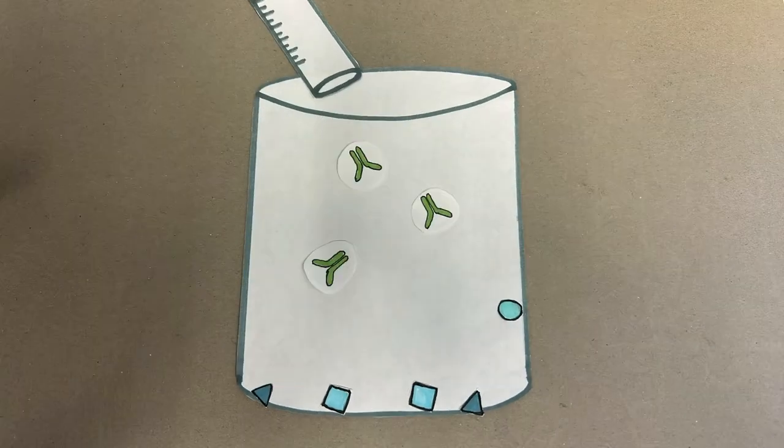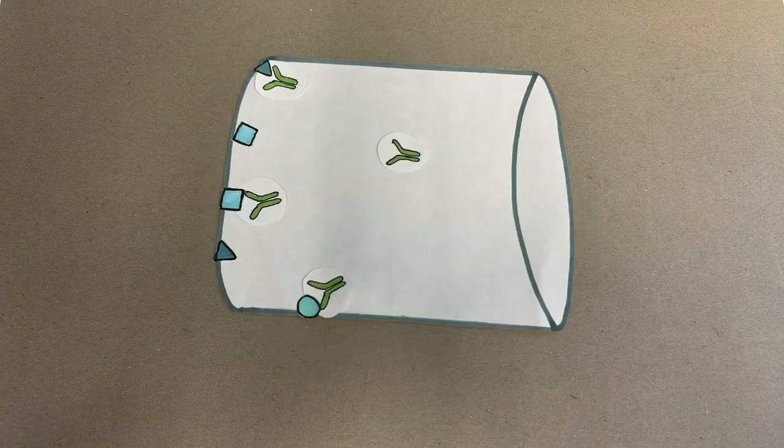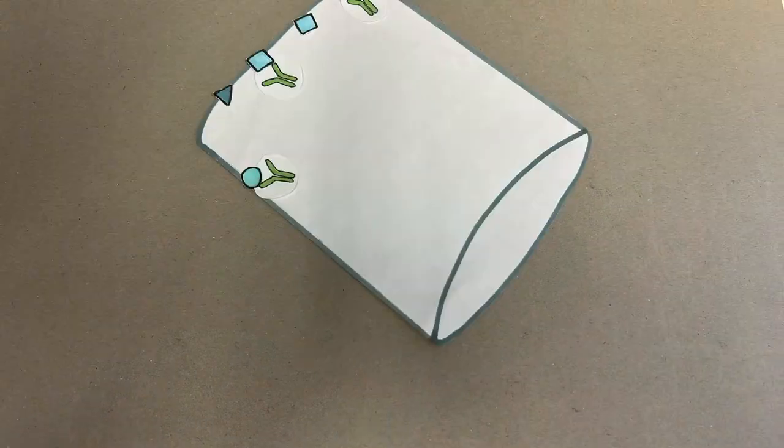A primary antibody is now added which may bind to the antigens. Then the well is washed again to remove any unbound antibodies.